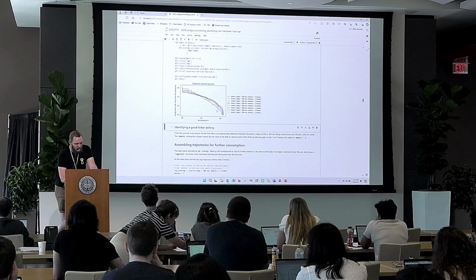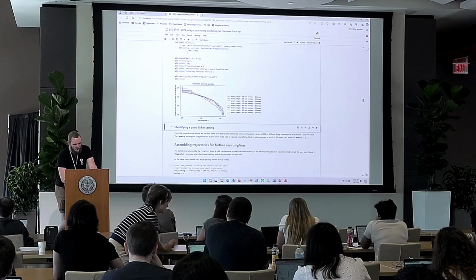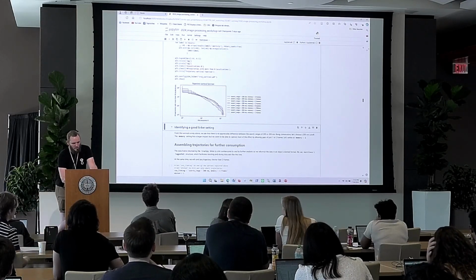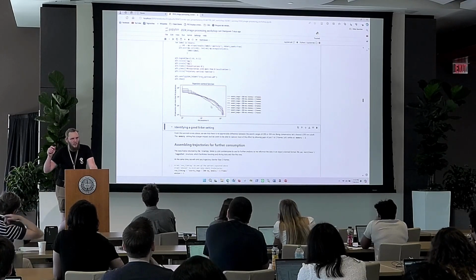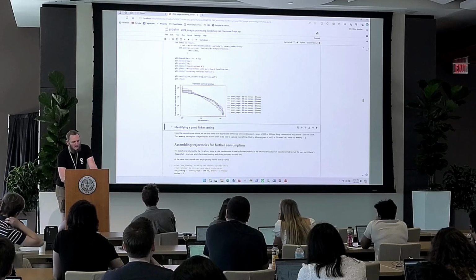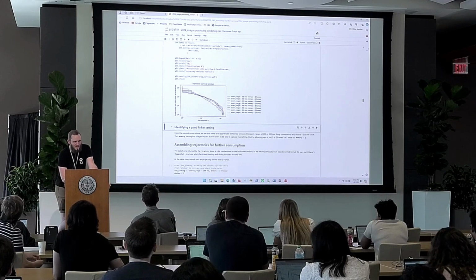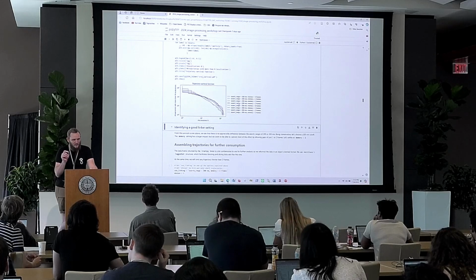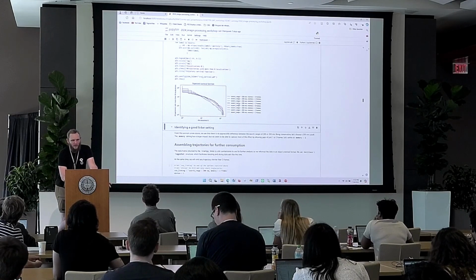First thing we see here is that there's a blue and a purple curve right on top of each other. If we look into the legend, blue is search range 200 nanometers without any memory. Purple is search range 300 nanometers without any memory. And if you go through the other curves, you will always see pairs of curves that lie on top of each other. Which means the search range setting doesn't really make a difference, whether we choose 200 or 300 nanometers, and that's exactly what we expected from this bimodal distribution that we saw. There are only very few steps that fall in between this gap, so whether we cut that off or not doesn't make a difference.